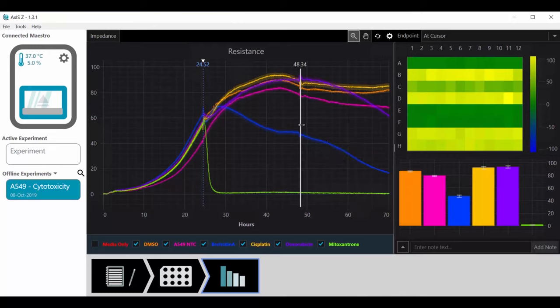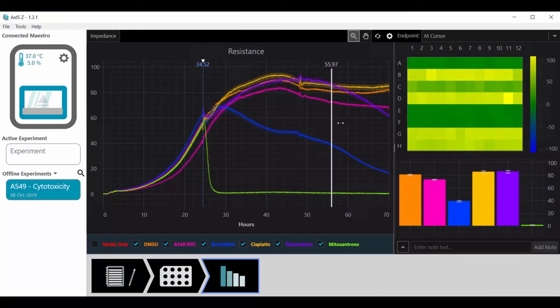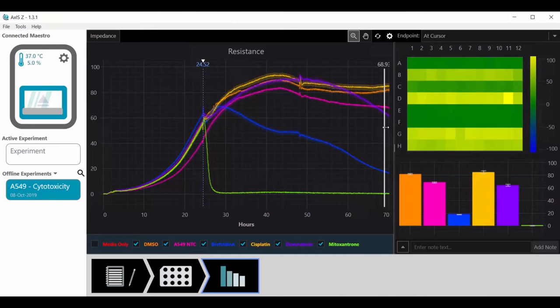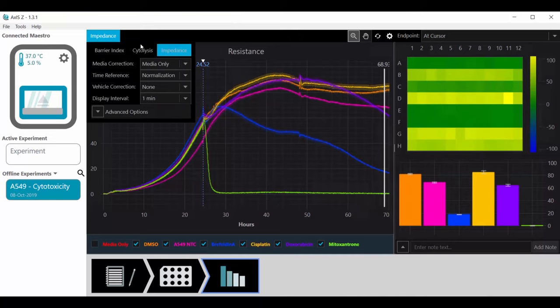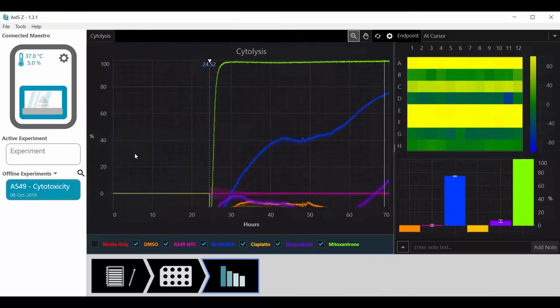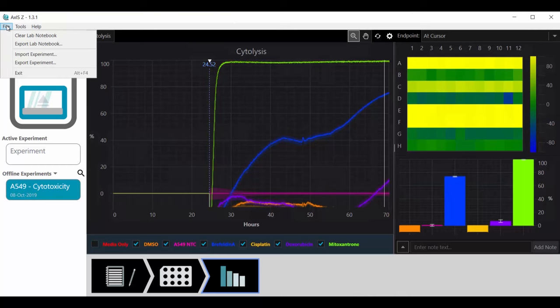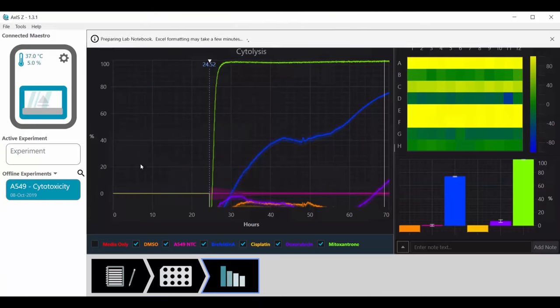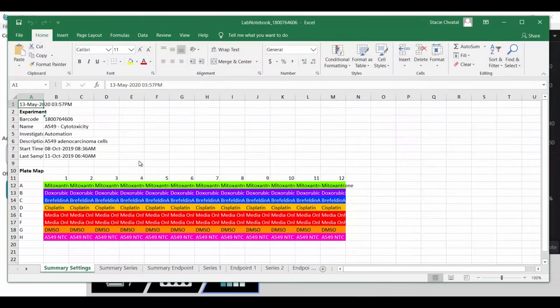Drag the cursor to see a comparison of the conditions at any time point. With just a click, switch to a cytolysis plot to see the amount of cell death. Then export a lab notebook to quickly send figures and data directly to an Excel sheet.